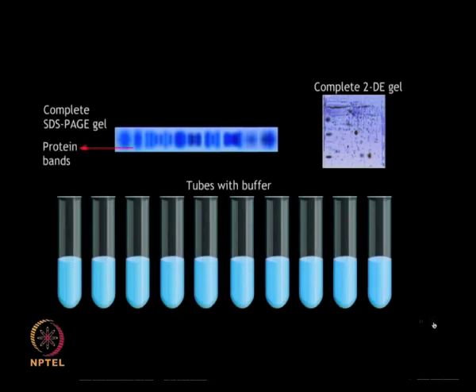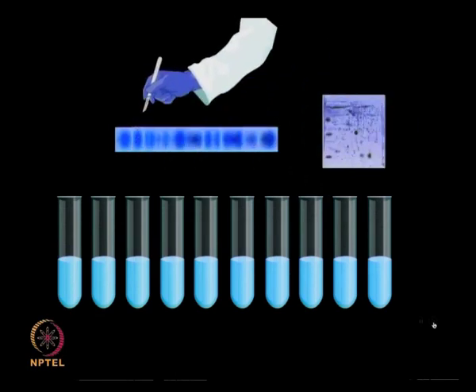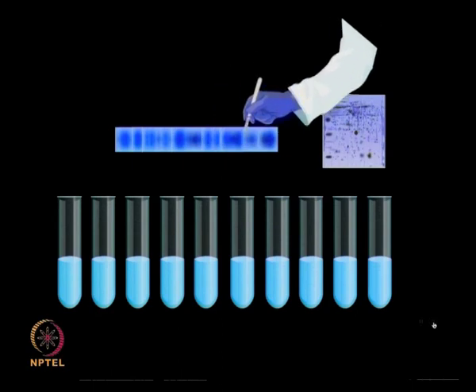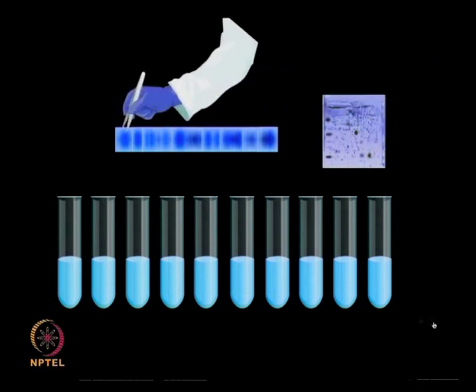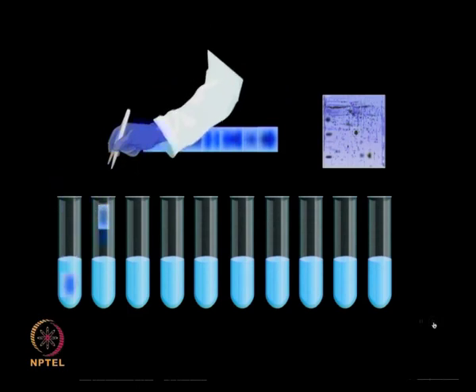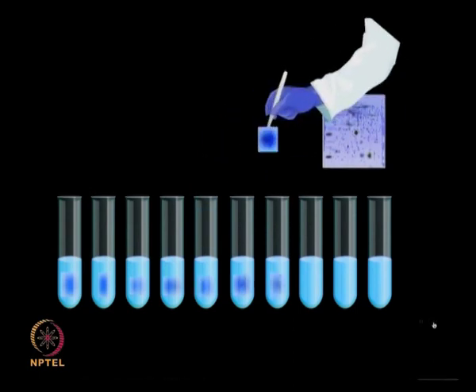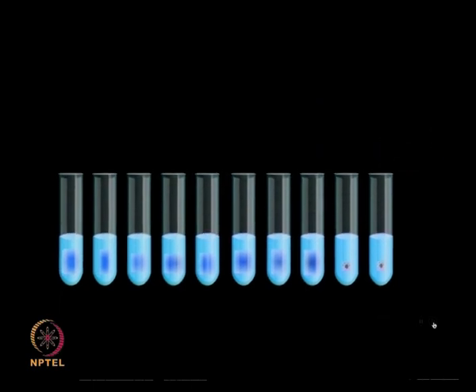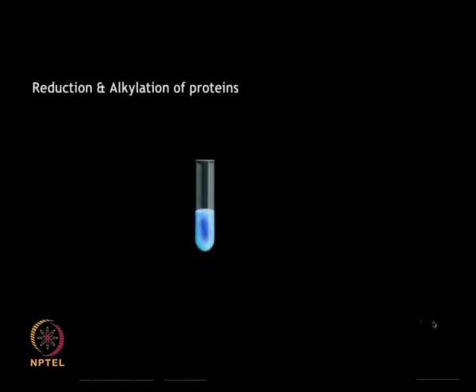Electrophoretic separation of a protein mixture results in distinct protein bands. These proteins can be used for analytical purposes by carrying out in-gel digestion. The entire gel is fragmented into small pieces, and each piece is dissolved in a suitable buffer. To simplify the complex proteome, it is a good idea to chop the separated proteins into smaller pieces.